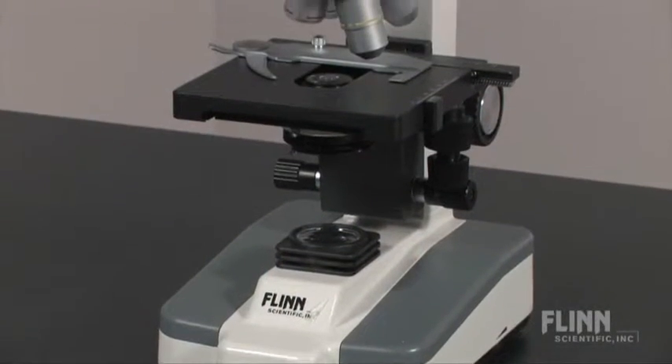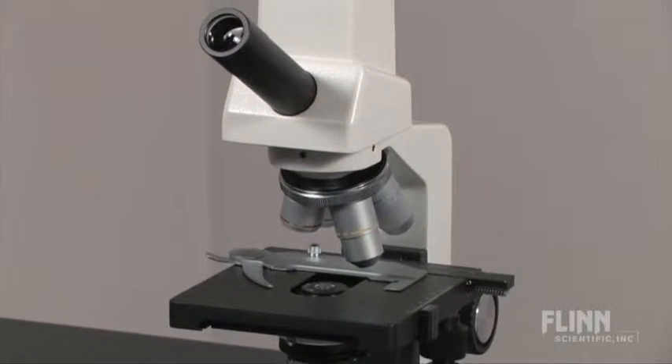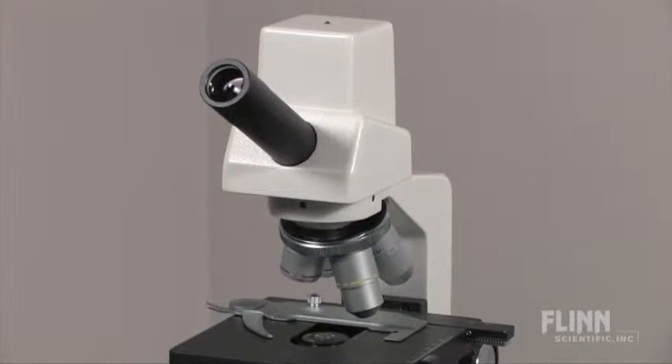Both microscopes have mechanical stages, 4x, 10x, 40x, and 100x oil immersion objectives, and separate coarse and fine focus knobs.